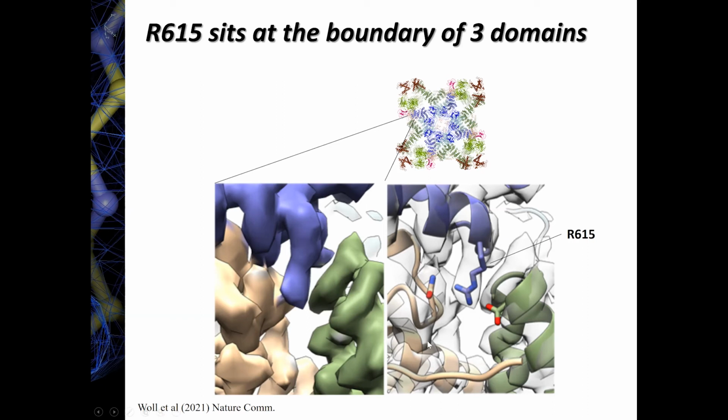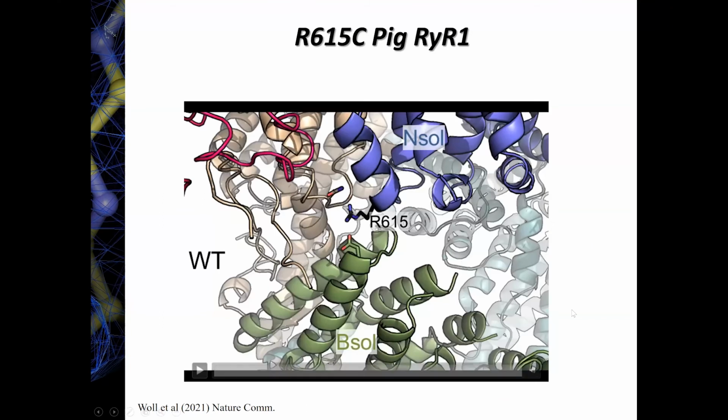Okay, so what is it actually doing? So you might imagine that mutating this to a cysteine is clearly going to affect the way that these domains interact with one another, but could it also trigger a conformational change? So what I'm going to show now is an animation that toggles between the structure of the wild type, which is what you're looking at now, and the disease mutant. So we got this blue and this green solenoid regions for those in the field. So these are called the N-terminal solenoid, and the green is the bridging solenoid. That's just a nomenclature. And arginine 615 is here seen at this interface.